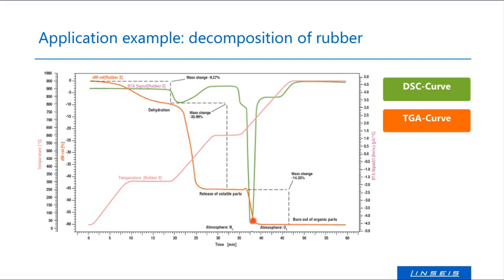This step here symbolizes the carbon content, this is the pyrolysis content, and this is the volatile content. And if you integrate the area beyond this peak, you can even get an idea how much energy is released by burning this mass of sample off. And this is how a typical decomposition analysis looks.